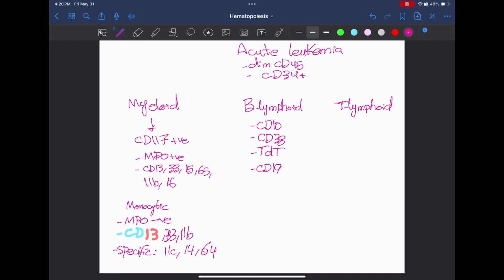Other markers of B cell differentiation that you can see include CD20, CD22, and CD79a. But CD79a can also be expressed in T lymphoblastic leukemia lymphoma. So if you don't have CD19 expression or CD20 expression, you should not consider CD79a as a marker of B lymphoblastic leukemia lymphoma in your case.